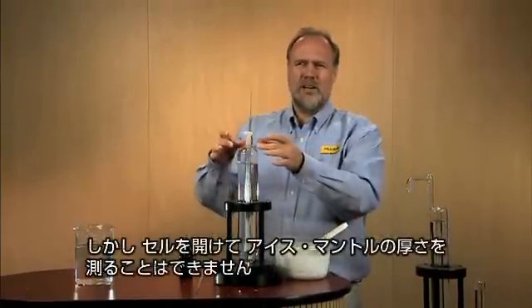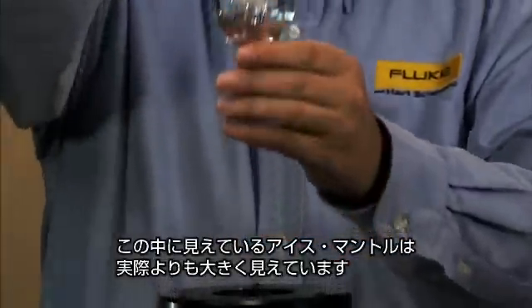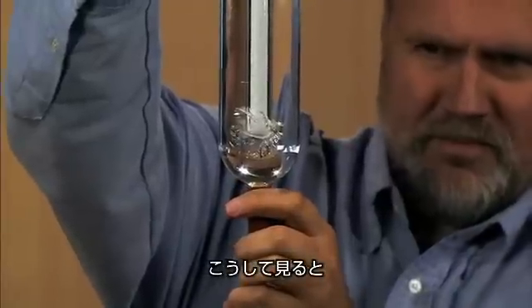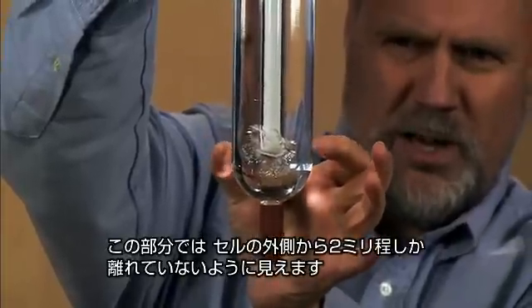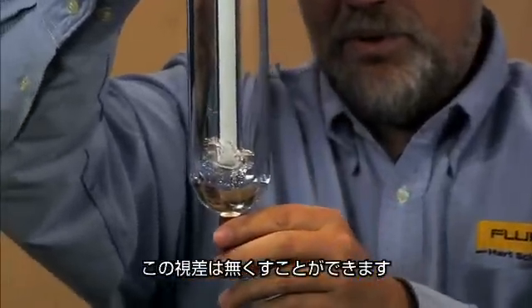Well, I haven't figured out a way to open that up and measure it with a pair of calipers. The ice mantle that we're seeing in there looks larger than it is. As I sit here and look at it, it looks to me to be just a couple of millimeters away from the edges of the cell down here.